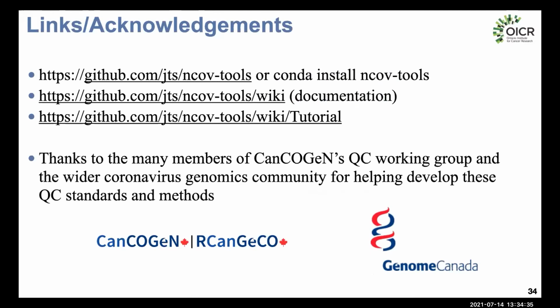All right, I'm going to finish here with just some links. So our software is all freely available on GitHub. It's probably easiest to install it with Conda. If you just do conda install ncov-tools, it will install the entire package. Richard's written some very nice documentation for how to configure the various features of ncov-tools and what all of the outputs mean. You can read that on the wiki here.